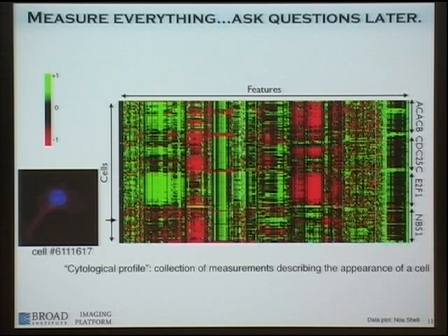So if you look at it, this is just showing 4 different samples, because more than that would be overwhelming. So here's 4 different samples. It doesn't matter what they are, but each of them has a certain number of cells, maybe a few hundred cells, and then several hundred features that have been measured. And you can see there's patterns that, you know, this sample here seems to have cells that mostly share a good proportion of features. A lot of the features are correlated with each other. You can see some interesting patterns in this data.